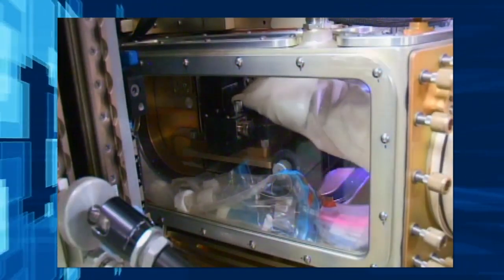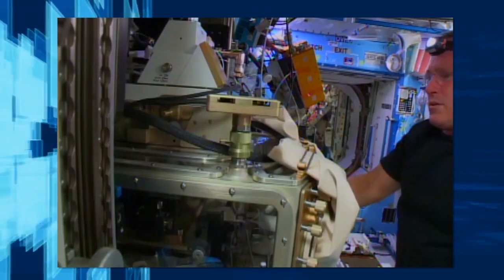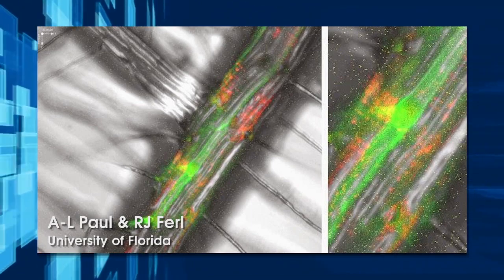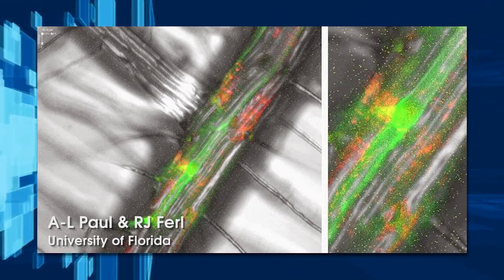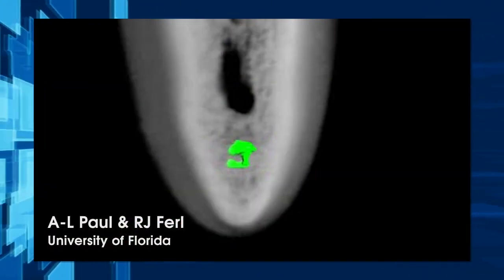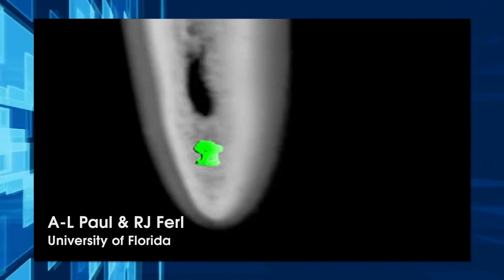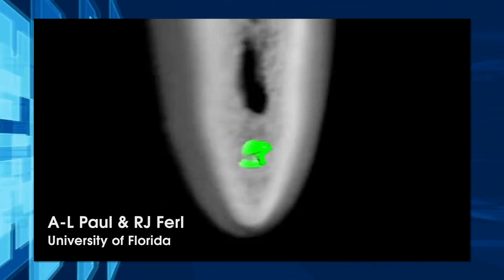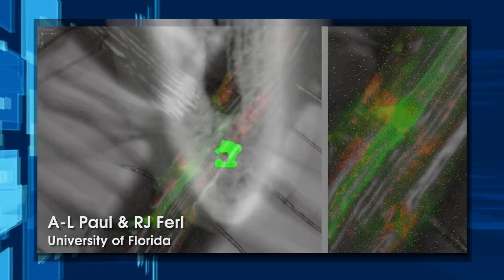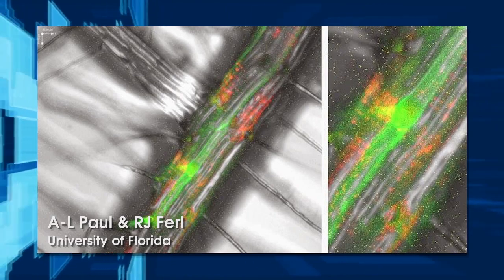But what the LMM allows us to do is to take things a little step further. We can now look at individual roots, not only at the macro level, but at the microscopic level. And not only just on the surface of those roots, but we can tunnel in a little bit by taking different focal planes of the same root and look deep inside the root tip to see which cells are expressing some of the green fluorescent protein genes in which we're interested. That gives us a whole new dynamic to ask how plants are responding and where those cells are changing inside those roots. And that gives us a much more dynamic range of gene expression patterns on orbit than we were able to get before.